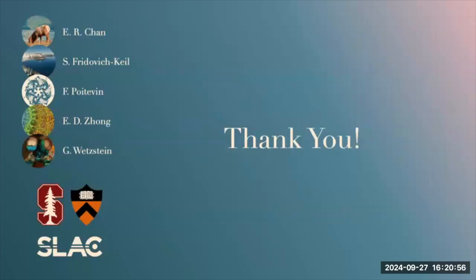I have a question: how does the map's resolution affect your ADP results? Yeah, I think it's mostly because the completeness of the output of the model is going to decrease.